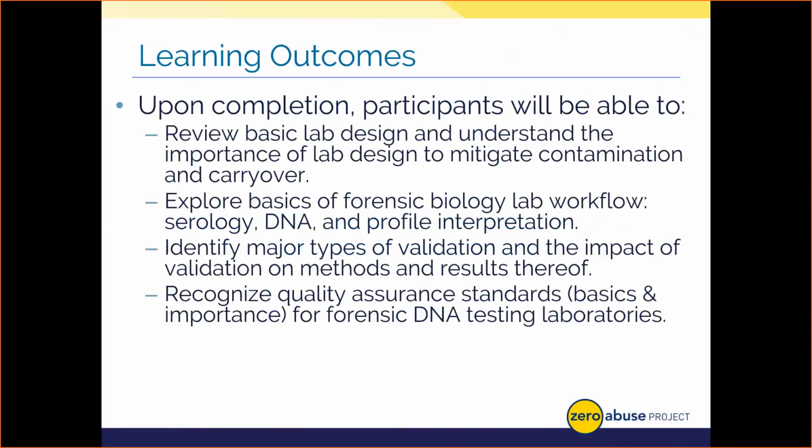So today's overarching goal is to really help you better understand the fundamental route by which biological evidence progresses through your typical forensic laboratory. I also hope you'll become more knowledgeable of and appreciate the level of care that goes into your evidence processing, from basic item examination all the way down to facility composition itself, so as to ensure that your evidence is processed free of potential contamination.